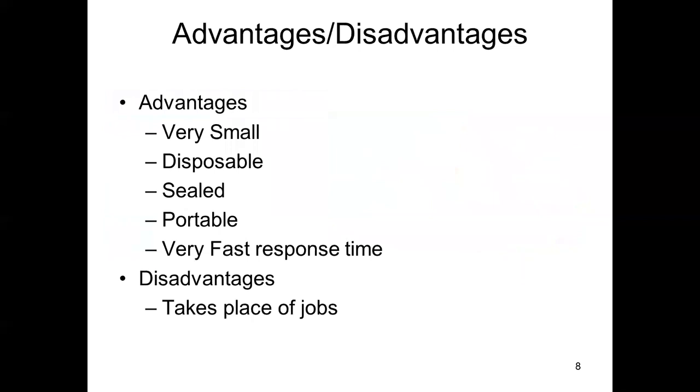So the advantages and disadvantages of these DNA labs on a chip: they're certainly very small, disposable, sealed, and portable, and they have a very fast response time.